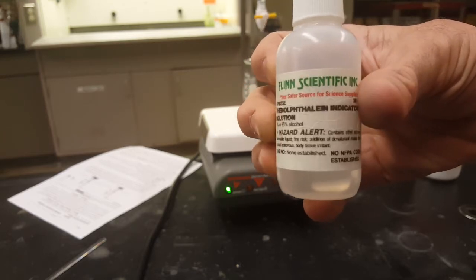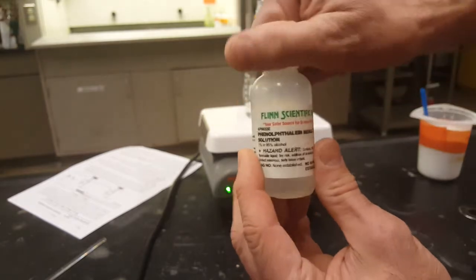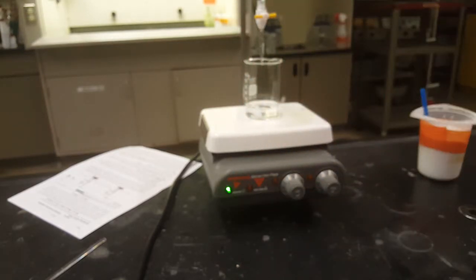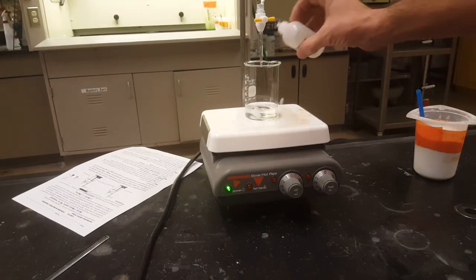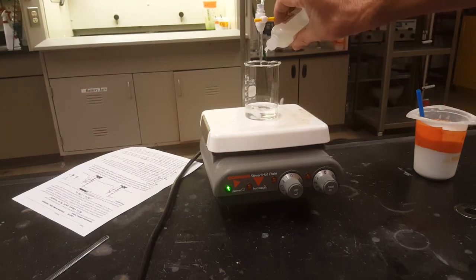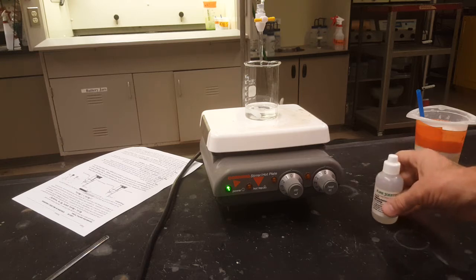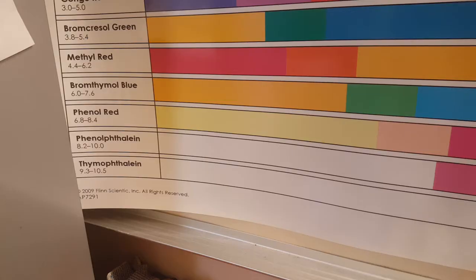Phenolphthalein. You don't need much of this stuff. In fact, what I'd like you to do is just use a drop. If 2 drops go in by accident, that's fine, but no more than 2. 1 drop will be plenty.